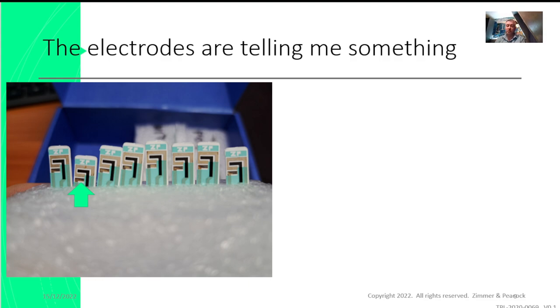And I showed this to an engineer. We were having a conversation about your electronics, your schematics. The first thing he said is, oh, they're oxidizing the counter electrode. They must be putting current through it or a voltage on it. I said, no. Well, they say no, but they are.